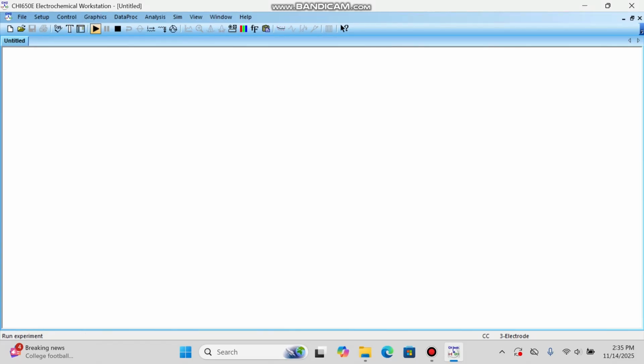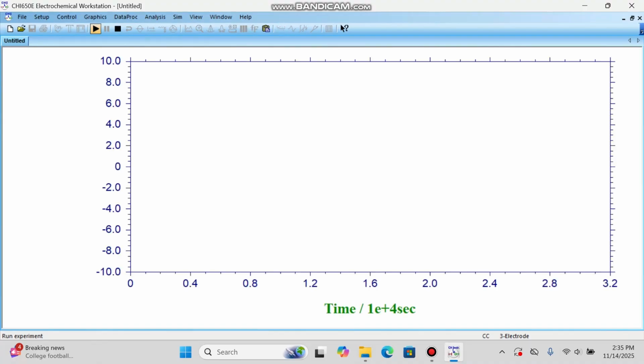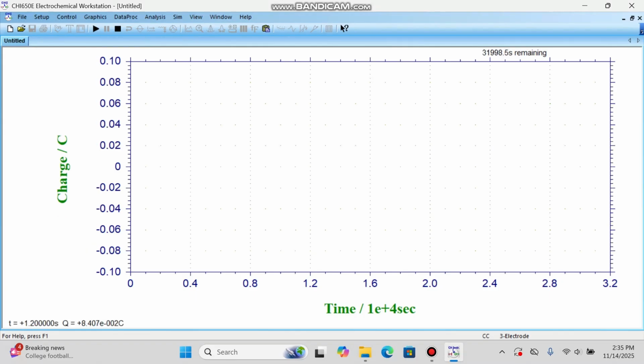In between, we also have to restart the program, because we can run this program for only 8 hours maximum. We just start the reaction by clicking the play button, and we will have to wait for 16 hours. The reaction was started, and after 16 hours, we will analyze the products.